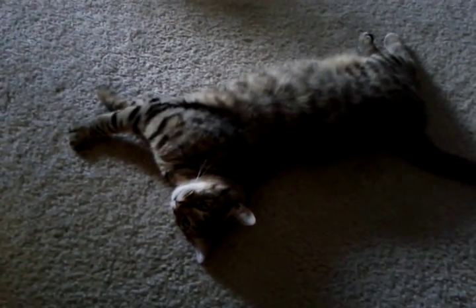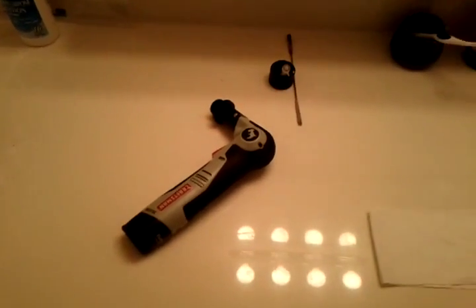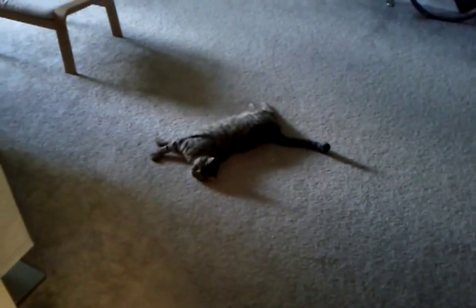So this is not going to be your ordinary internet cat video. In this video, I'm going to try out the Zymo Research DNA soil and fecal extraction kit with their sample processor device here. Buzz is going to provide the fecal sample.